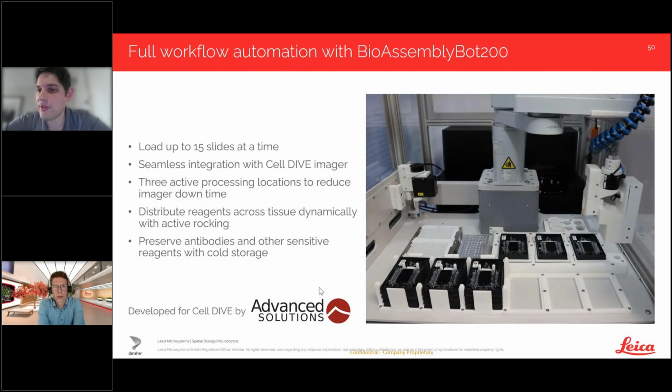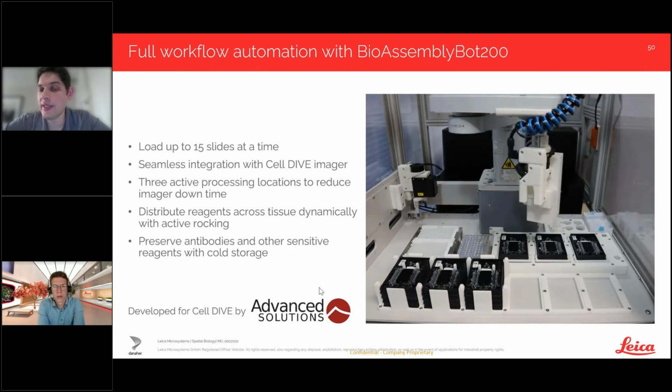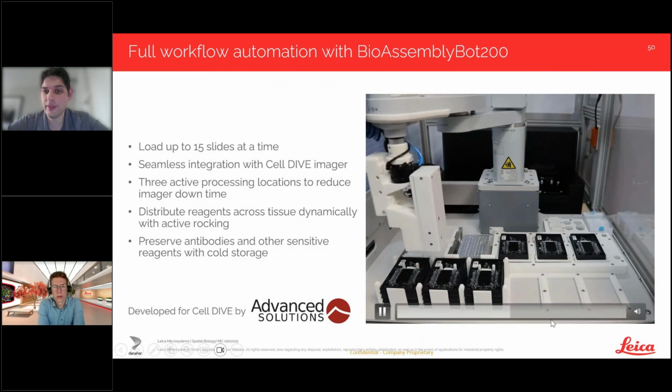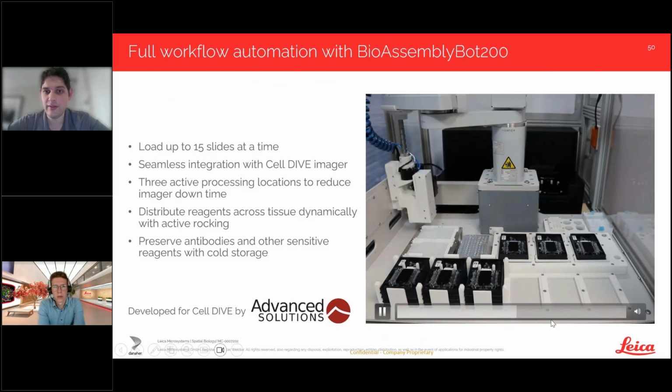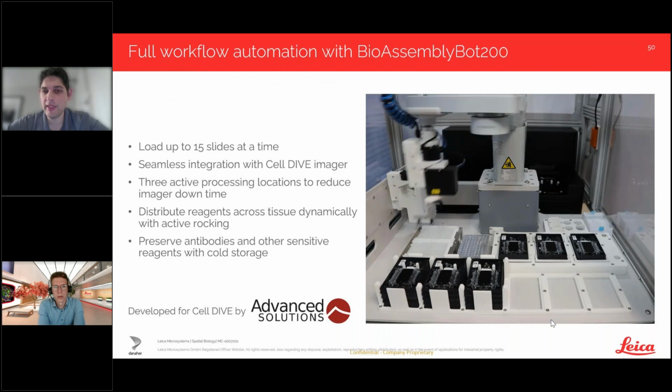And shortly after this, it will switch out the liquid handling tool for a plate handling tool and load slides into the imager. Maybe we'll get to see that here. And that's the plate handling tool.